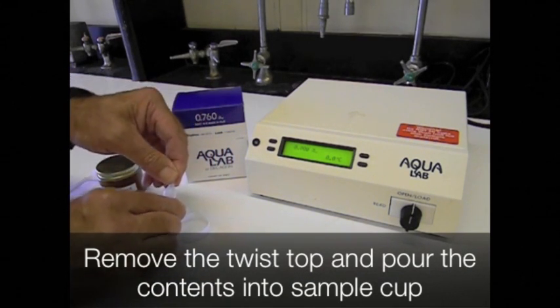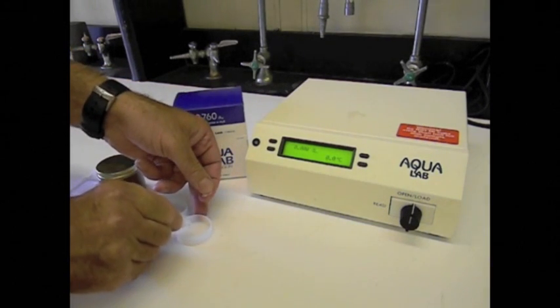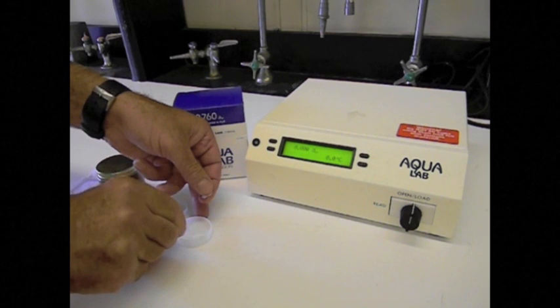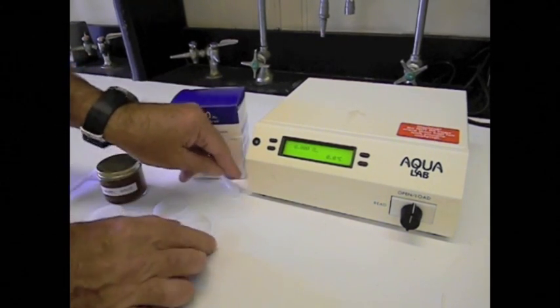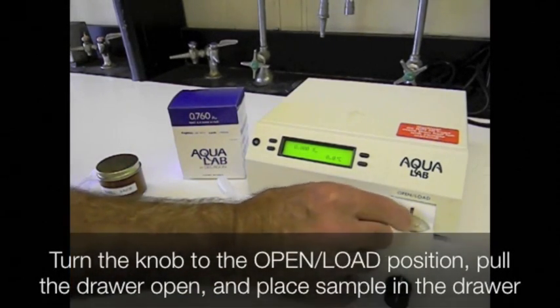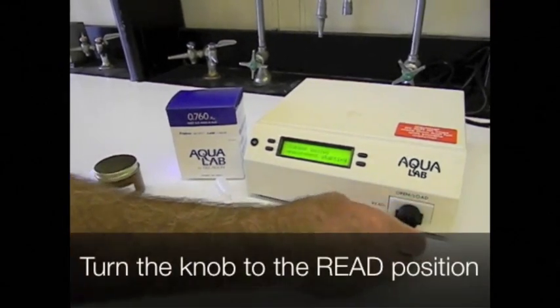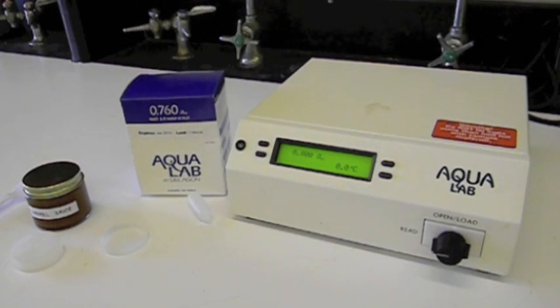Remove the twist top and pour the contents into the sample cup. Turn the knob to the open load position, pull the drawer open, and place the sample in the drawer. Turn the knob to the read position. After a few minutes, the standard reads 0.760, indicating proper calibration.